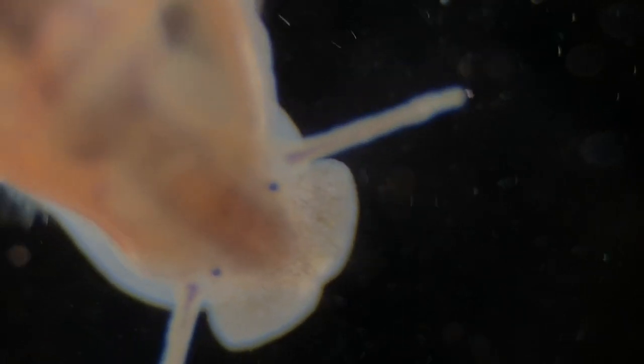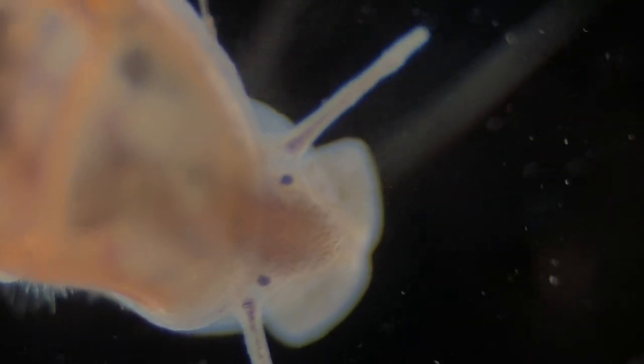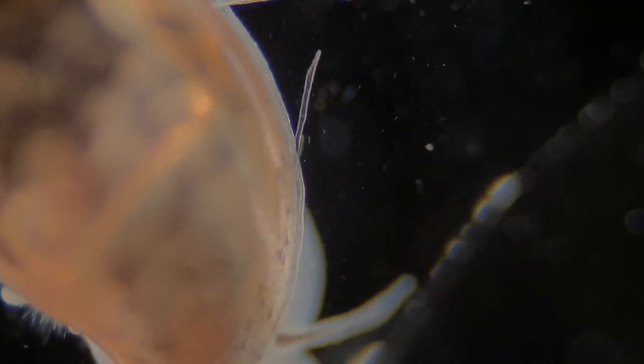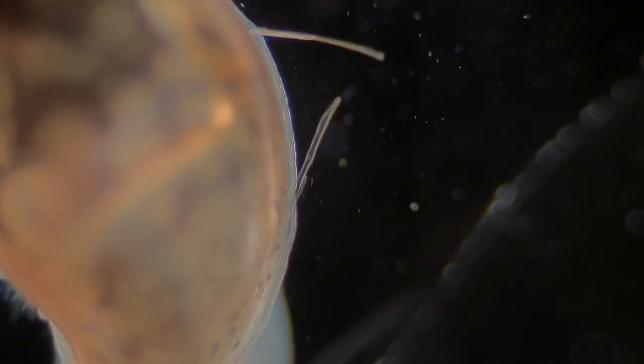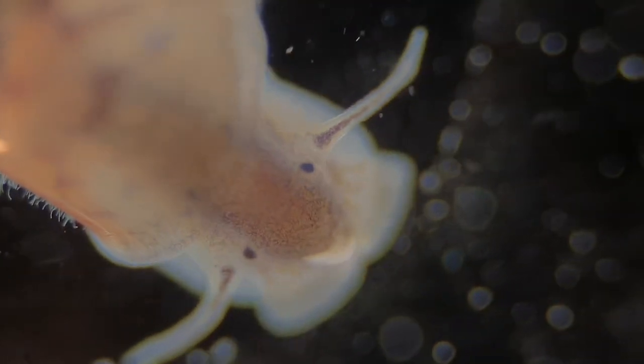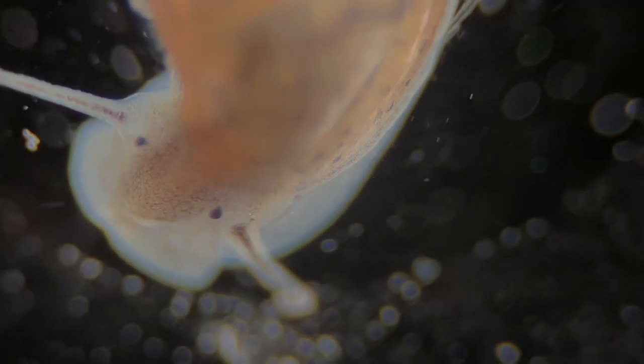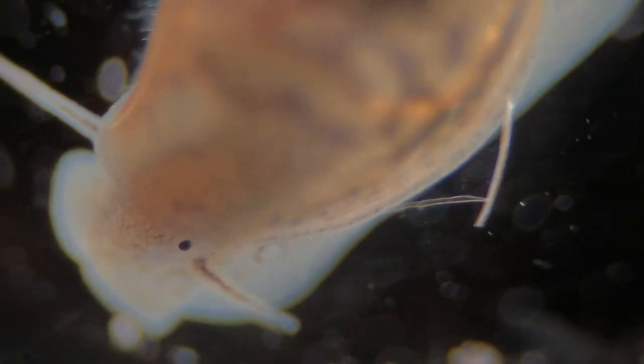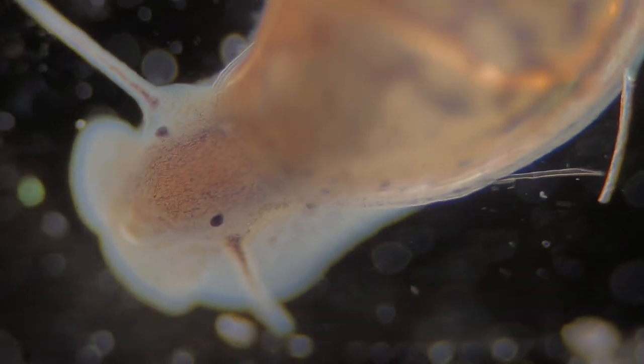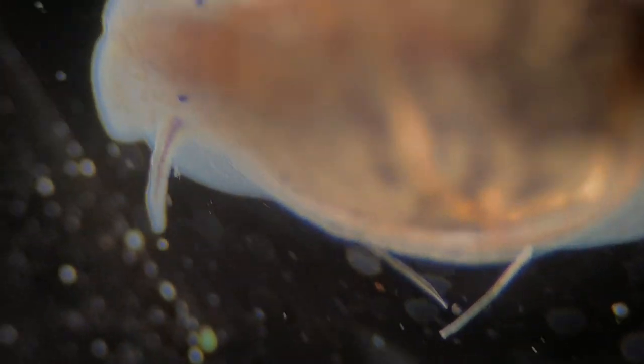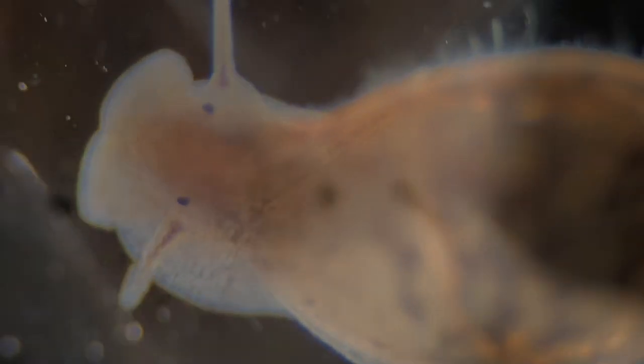One of the other things that you might notice is that half of this thing is blurry and the other half is in focus, and it is really hard to get this entire thing in focus mainly because of how big it is. That's just the way microscopes work with larger organisms. Microscopes are built for things that are a lot smaller and so they have a smaller depth of field. Occasionally you get a really nice good view but sometimes you just want to get a little bit closer. I wanted to see the eyes here for example and you can see everything else is out of focus just because of how thick this thing is.